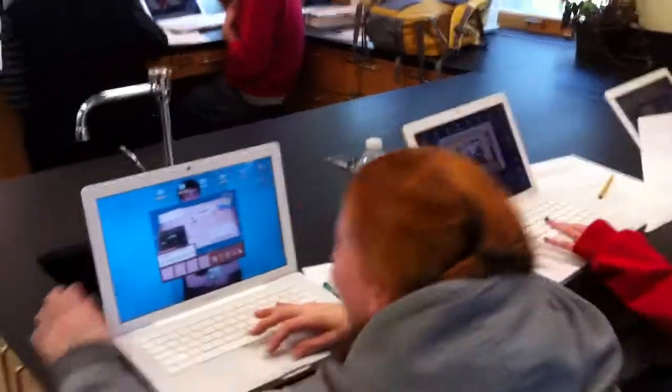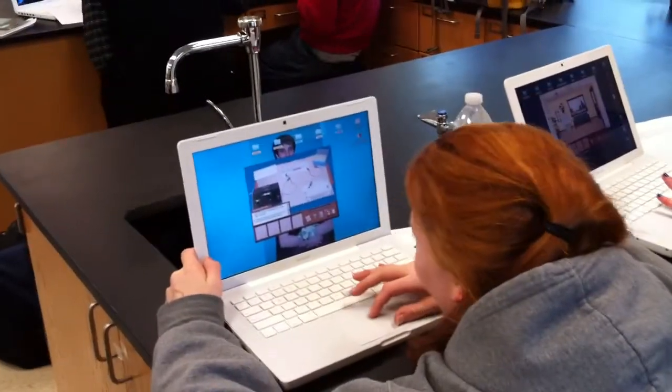Well, this one comes off a particular site. They have another one on plant genomics there. What color is negative, black or red? You gotta read it. I did. Oh, black.